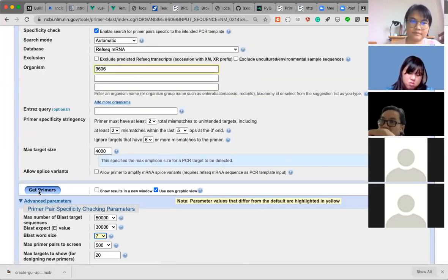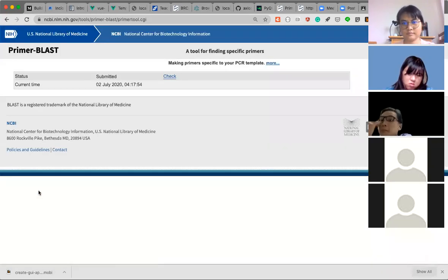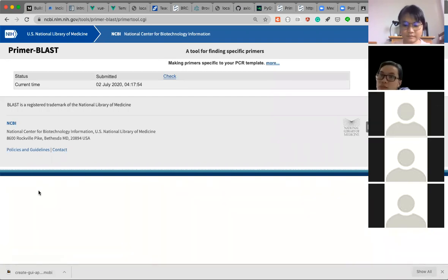Otherwise, you can just go with the default settings and see what you get. And this is going to take a while. Just have to wait.